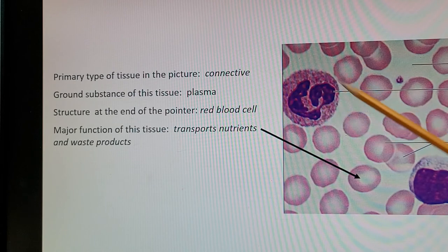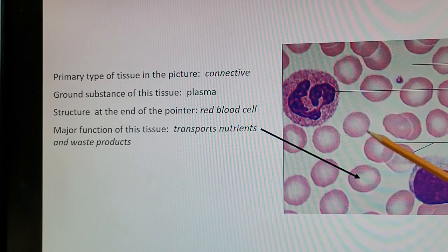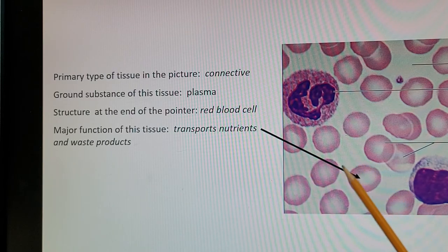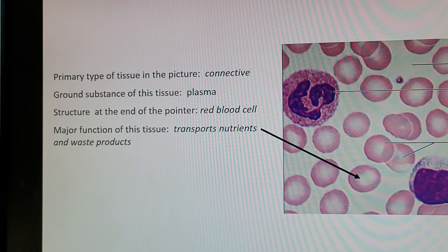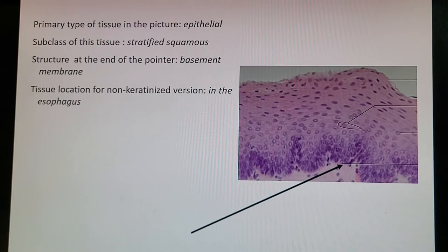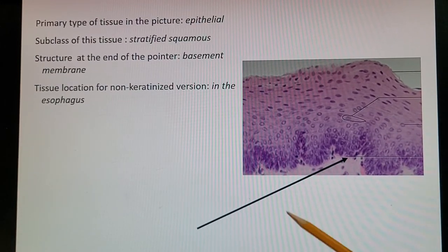Here's another connective tissue: blood. The ground substance — the space between the cells — is made up of plasma. The structure at the end of the pointer (the dark black arrow) is a red blood cell. The function of this tissue is to transport nutrients and waste products.